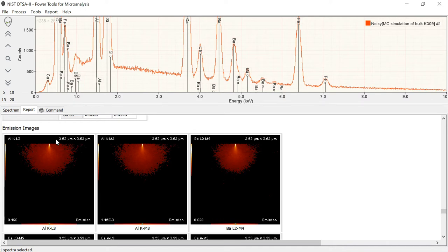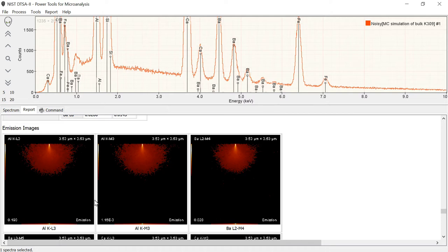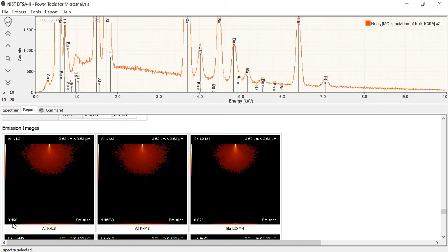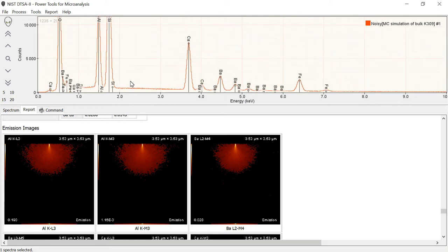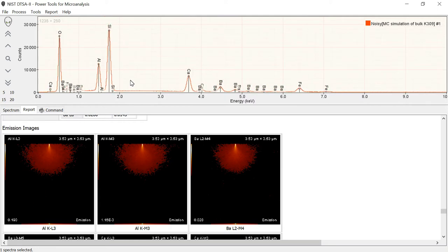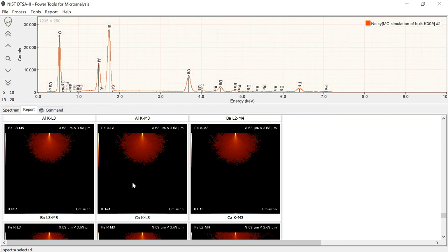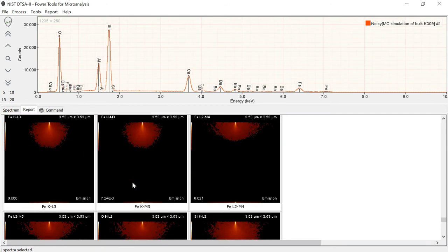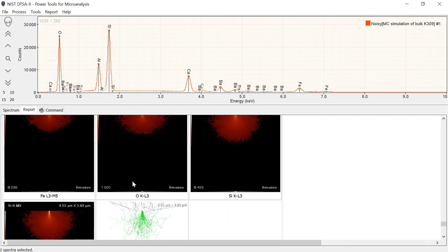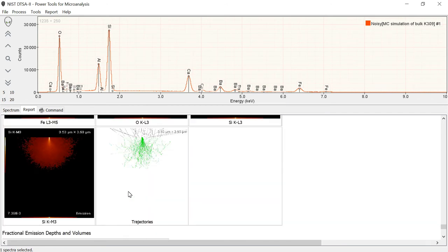We have a scale marker up here. So this total from this side of the image to this side of the image is 3.5 microns. From the top of the image to the bottom of the image is 3.5 microns. This number down here represents the fraction of the most intense line. So aluminum K represents about 20% of the most intense line. And if we look over here, we can see that that might be reasonable. So there's a lot of different images. One of the more useful ones is the trajectory image.